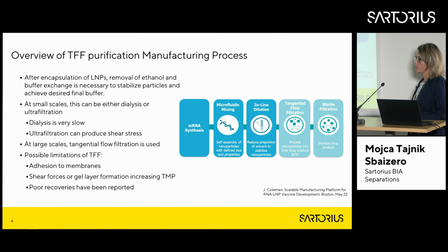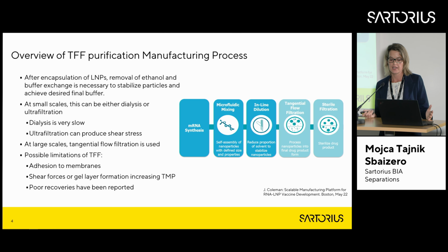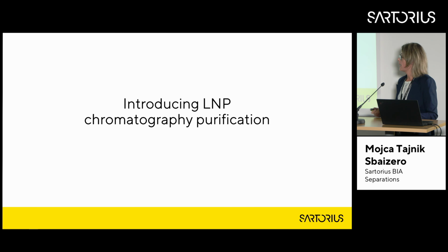But what is the real problem with this is first scaling up, and second the shear force that is produced during the TFF. You know, the one that is using this in the lab, you always need to, let's say, keep the constant shear rates and so on. I am telling you that this is really important, this actually damages your particle at the end. And this brought us to the idea that chromatography would be the right solution.